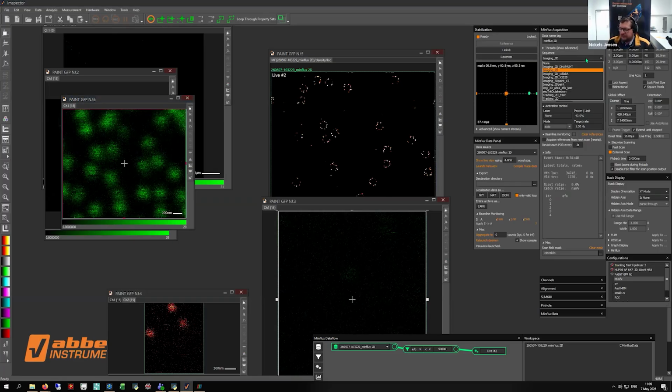Before, for 2D imaging, the system automatically set all settings for 2D imaging, a 2D donut, which patterns are used, how we iterate down. Now I just decide to use 3D. That's then the imaging 3D sequence. I rename this MINFLUX 3D. I have to change the acquisition power a bit because with the 3D donut we need different powers, as the power distribution is a bit different. And then I can directly start the MINFLUX measurement.